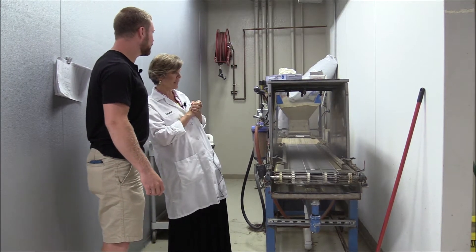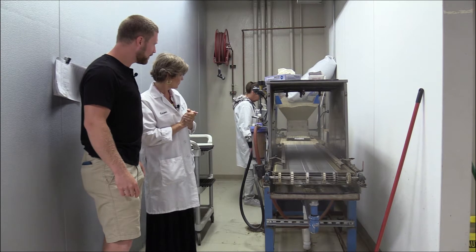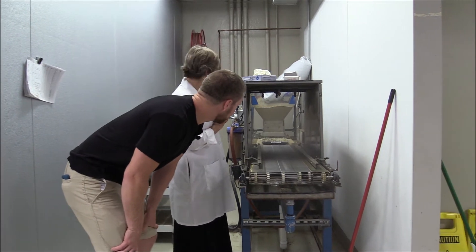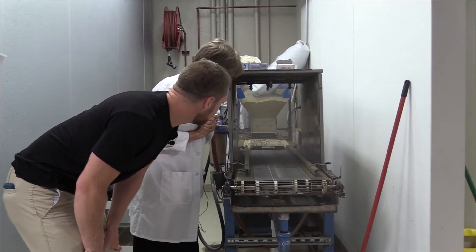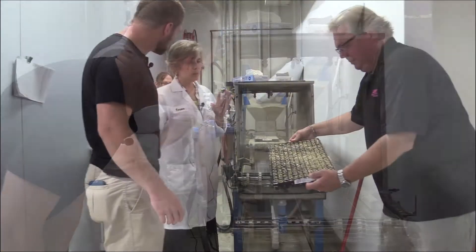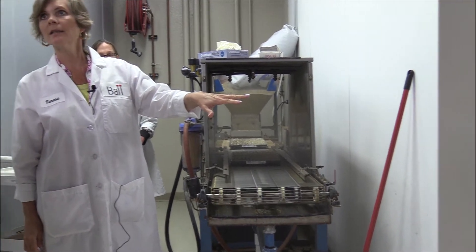Certain crops grow better with a vermiculite cover, and then we're going to actually water it through. It just comes right on down the line and gets a nice even coating of mist. This keeps it very uniform — everything we do here seems very uniform. The amount of water we use is very consistent, so we give it a little bit more water if it has vermiculite on it.